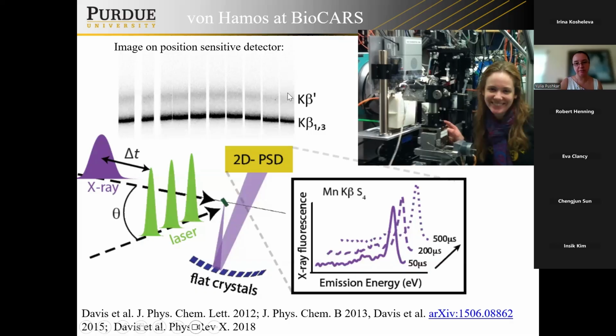Dispersive means the energy of the X-ray changes in this direction, and in this direction it's kind of focusing those X-rays, and we can collect a good amount of data. Again, we're gaining background here because we're not that tightly rejecting scattering, and also the system is very dilute, but this is how this spectrometer performs.